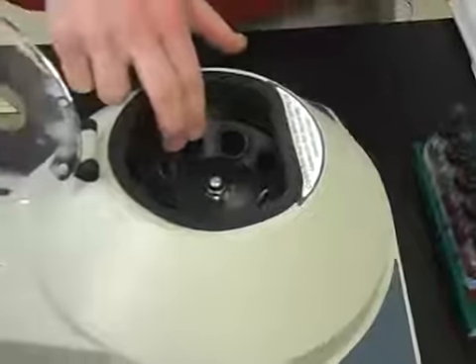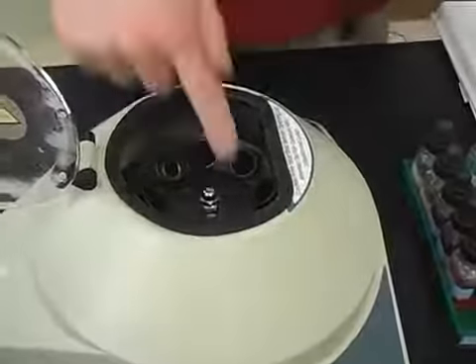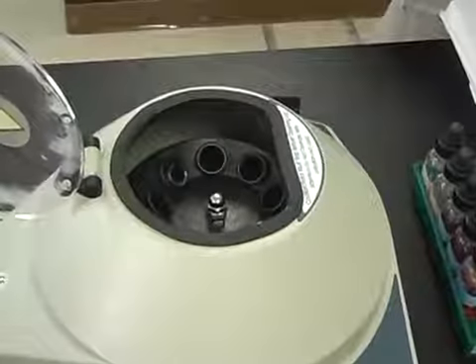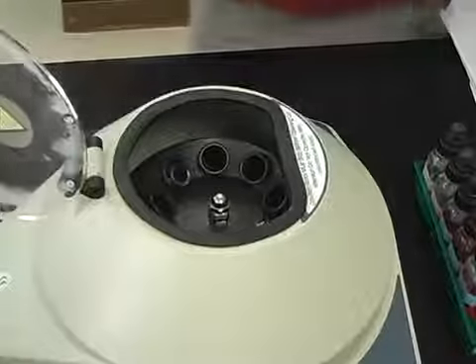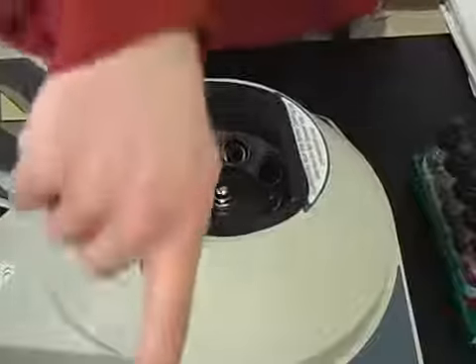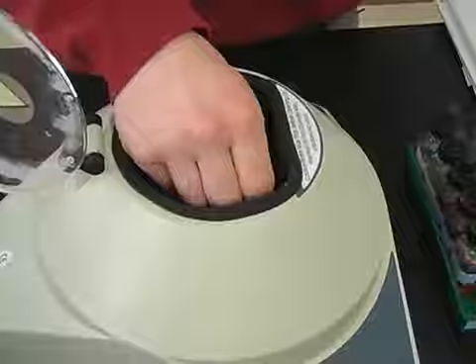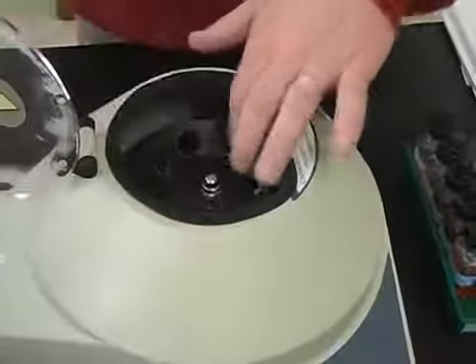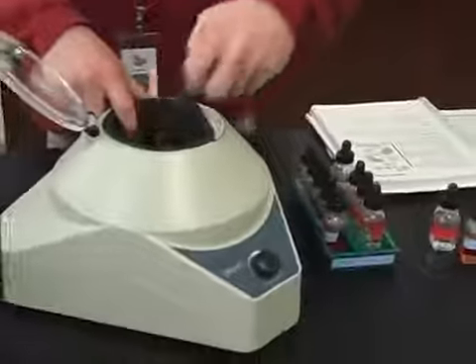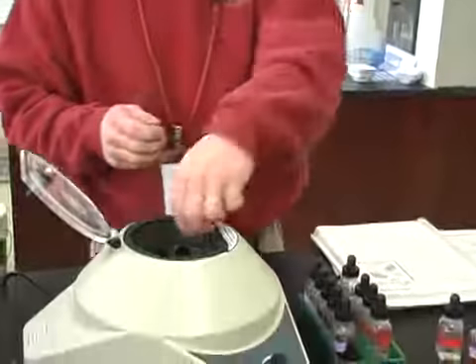And if you want to centrifuge more than 2 things, this can hold up to 8, you could partner with somebody next to you and put their solution opposite. Or some people like to run 2 or 3 trials at the same time. And maybe you want to have the other people put theirs opposite of yours and see how they go. One goes this direction, one goes opposite, and they just have to be all equalized out throughout the centrifuge. So if you're going to centrifuge 3 things, you can do that. Just make sure that they're at 120-degree angles to each other.